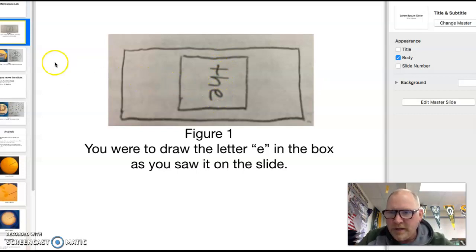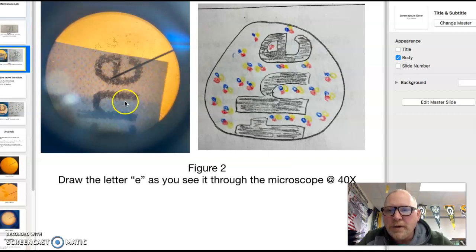Okay, so when we started looking under the microscope, through the eyepiece and the 4-power objective lens, which we call the scanning lens, this is what we saw. We saw the T, the H, and the E, and we could see that it was flipped around and inverted. You could also see that the letters in the magazine were not perfect. They were fuzzy on the edge, and around it you could see the red, the blue, and the yellow little dots of ink from the printing process.